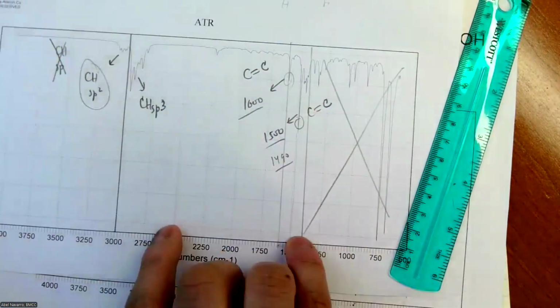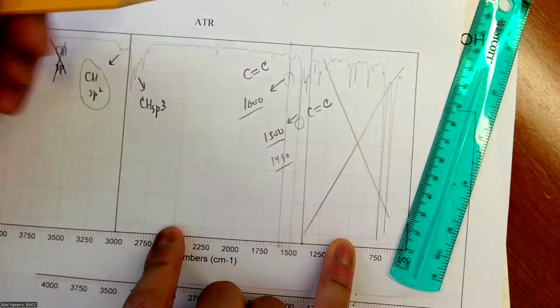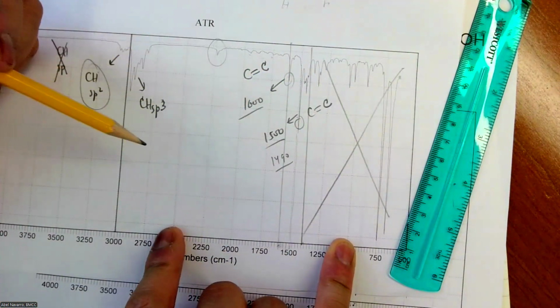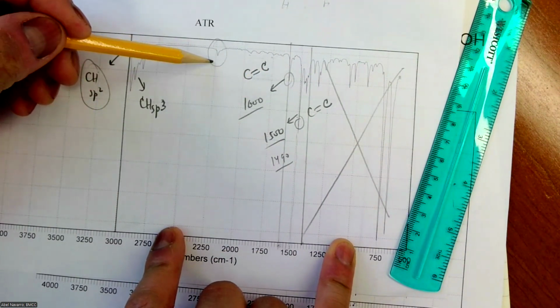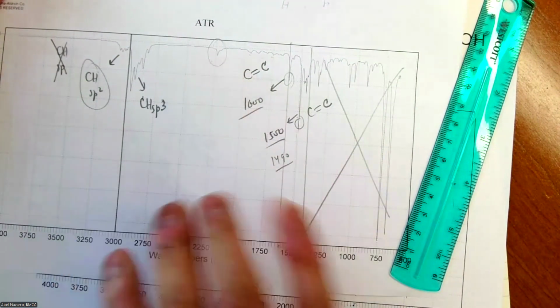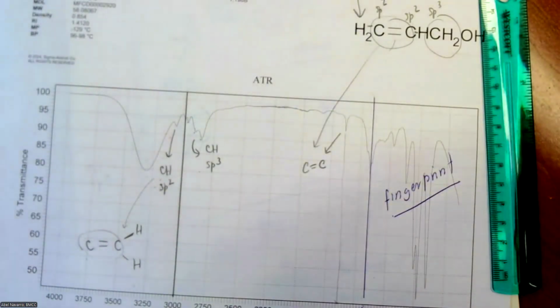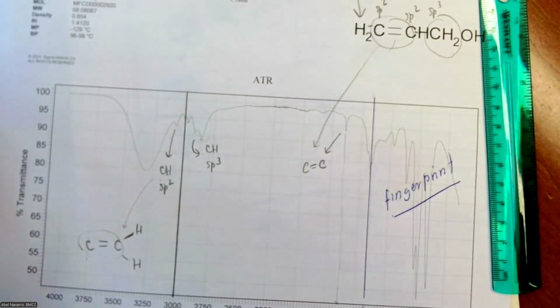two peaks. Now I say, like, professor, what about these ones? Are they noise, right? This one is actually no noise. That one, we will go back to this particular peak in a minute, okay? You can more or less imagine, right? What is that one? We already assigned everything except this C triple C, right? So we will go back to that particular peak in a second, all right?